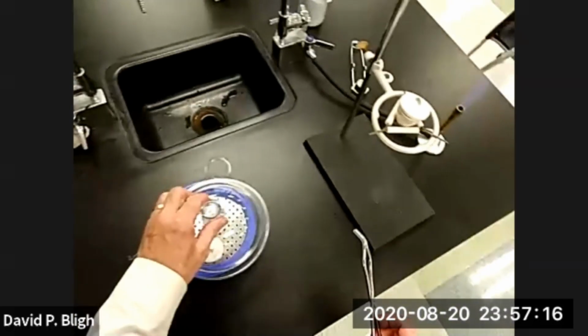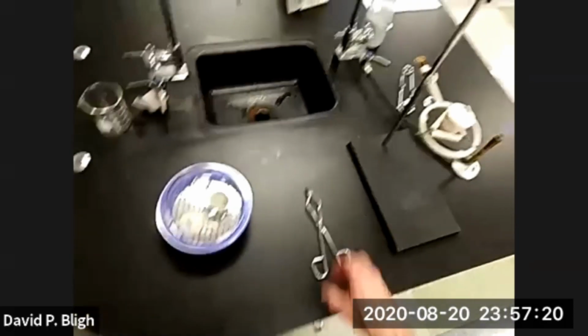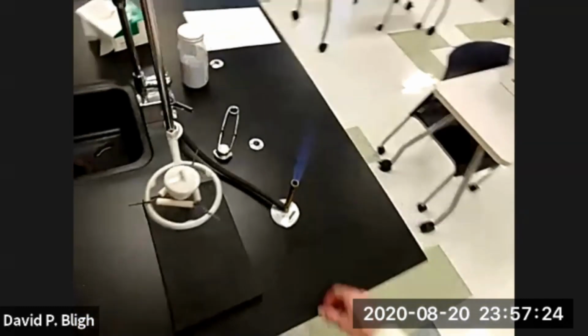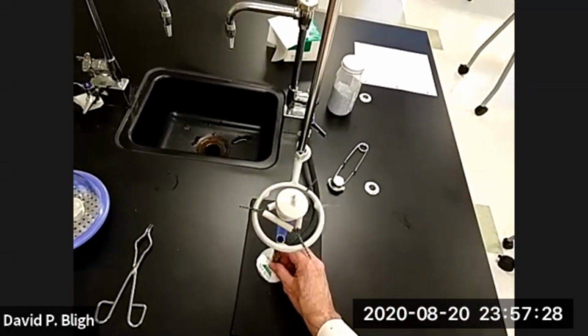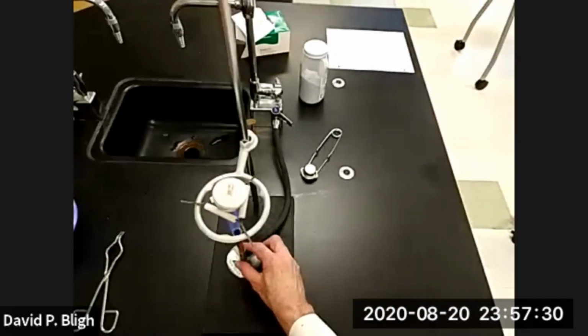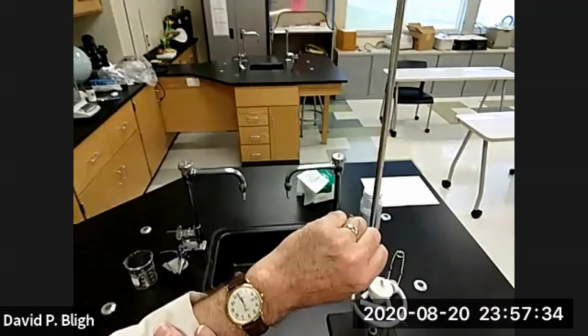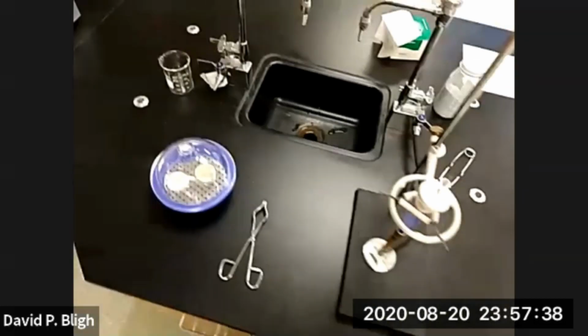There we go. And let that finish cooling down in a 0% humidity environment. Now let's move the heat back under this one, center it, and check our time. So about 8 minutes after 12, this one should be good to go.